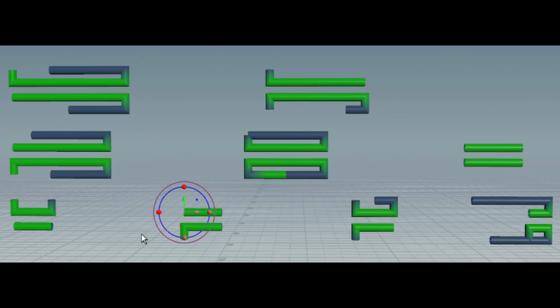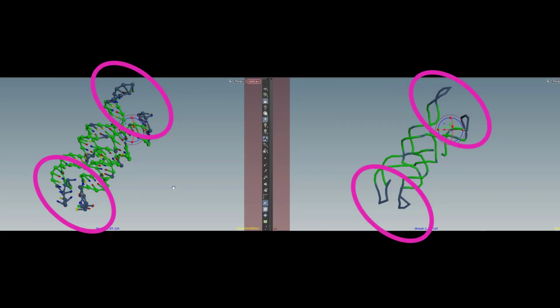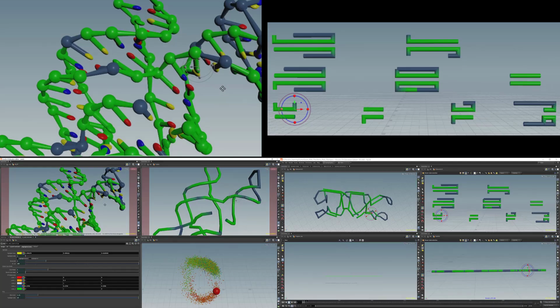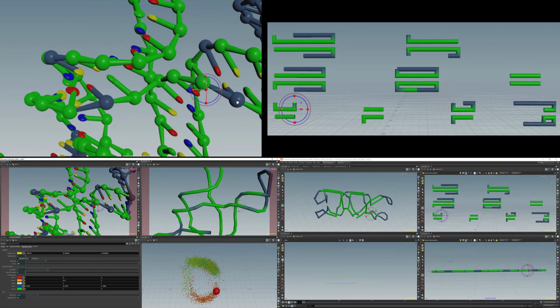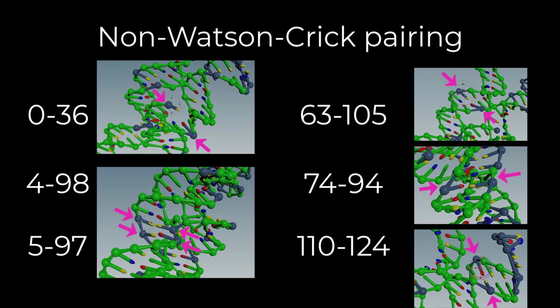Looking at this bizarre schematic 2D view, one might wonder what these nucleotides are that are not forming helices. A close examination from the linked view with the help of the highlighter reveals that, apart from the non-pairing loop on the sides of the structure, there are 6 base pairs that are in the hydrogen-bound distance, but their sequences do not obey the Watson-Crick rule. The designer might then proceed with changing some of the sequences on those base pairs and see how the design behaves.